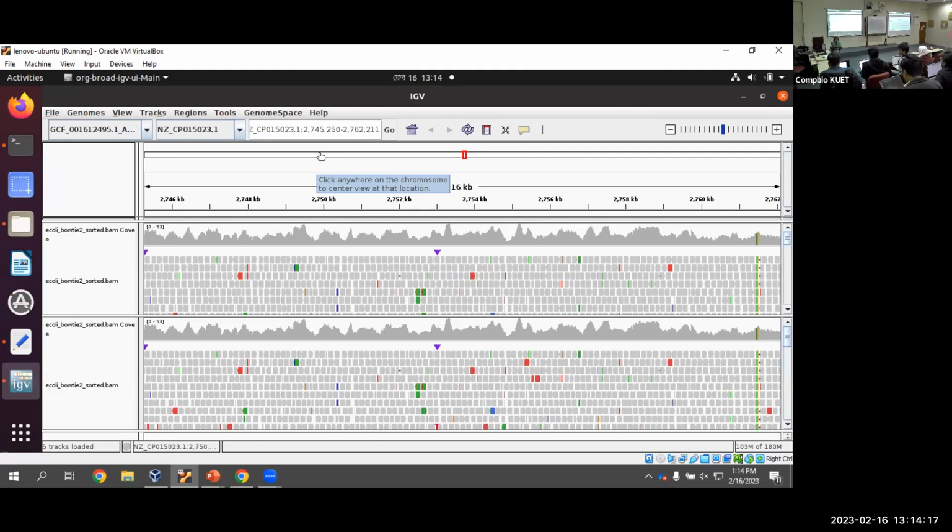But so far, we just did the first QC, the quality assessment. Then we trimmed our sequences accordingly, according to the threshold level. And then we used those reads to map to the reference genome and see how it comes out. But this is the major portion of most of the genomic analysis we need to do. And if you understand it, we'll get things easily later also.